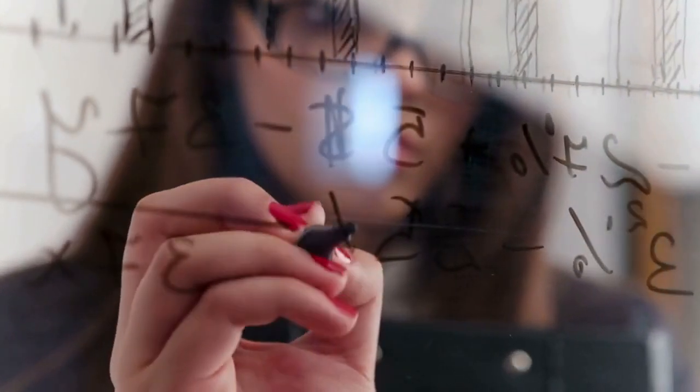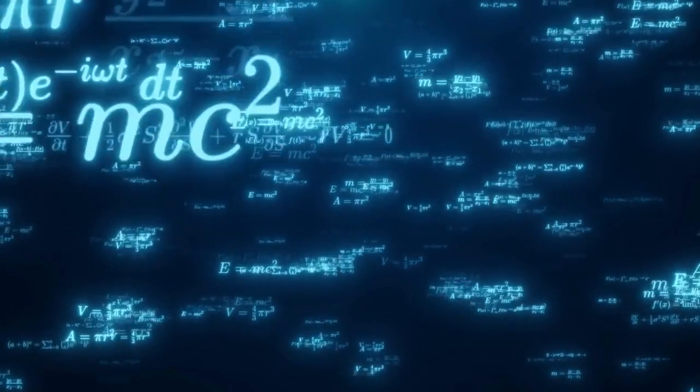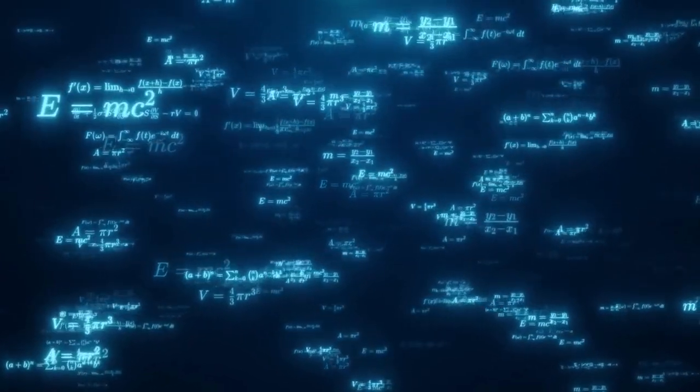Then, a computer performs a rapid mathematical calculation called a Fourier Transform. This calculation is the magic trick that instantly unscrambles the complex interferogram and converts it into the familiar, easy-to-read spectrum.